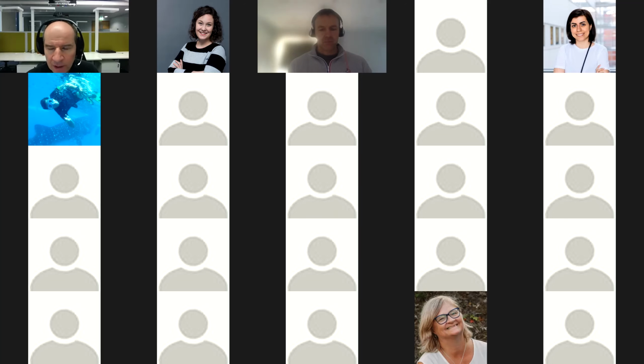Simple reason. Locally means what? Well, you probably have some laptop or desktop and your data will be sitting on the laptop or desktop. Omero is built to be used by a lot of people, and it will also be taken care of. Like the images on the server are not there just one day and the other day they are not. Okay, this cannot be like that.